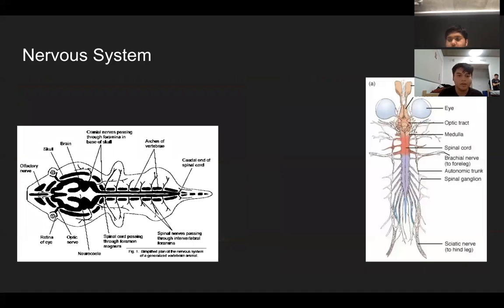Okay, so we're going to be talking about the rat's nervous system and the frog's nervous system. Hopefully Sid can help point out some of the stuff I'm going to be talking about, because I cannot. First, there's the brain. The next thing I'm going to show you is the spinal cord, which is what it shows on the diagram. The spinal cord's right there.